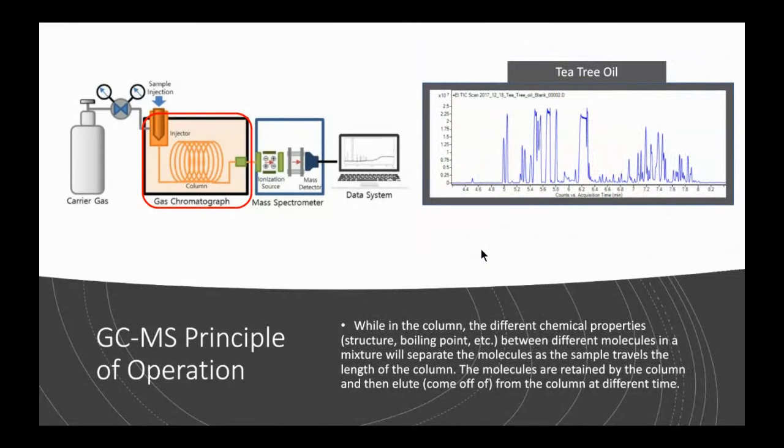All right, so the next system there is going to be your mass spectrometer. Oh, I'm sorry, one more detail about the column. Your compounds are getting separated on the column, and as they're coming off the column, you can note here, this is counts versus acquisition time. The first items that you see down here, at about 4.4, 4.6, at about 4.5, this compound came off the column first.